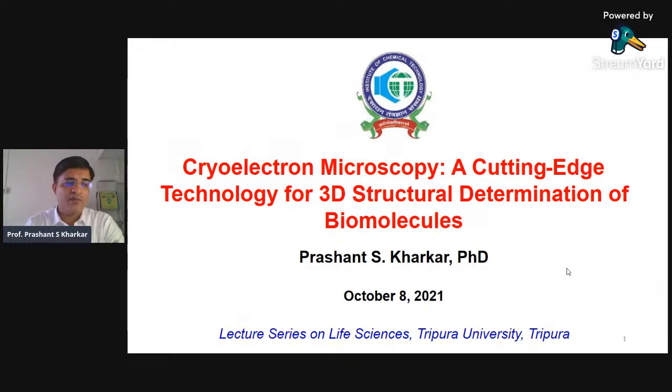It's pretty old. It dates back to the early 1970s when somebody tried to use electron microscopy for looking at the 3D structural aspects of biomolecules. In fact, one of those people, Dr. Frank, eventually got the Nobel Prize along with two others in 2017 for chemistry. And I will be mentioning that towards the end of my talk as well.